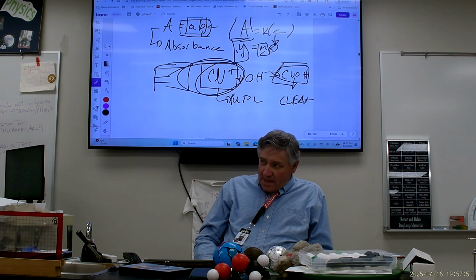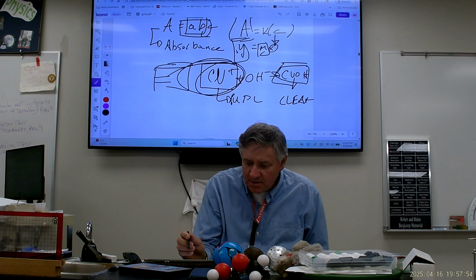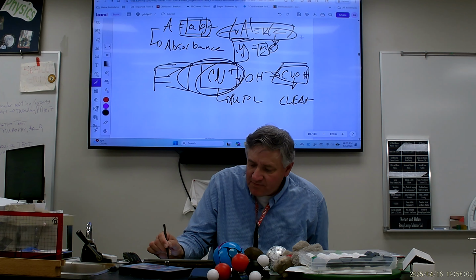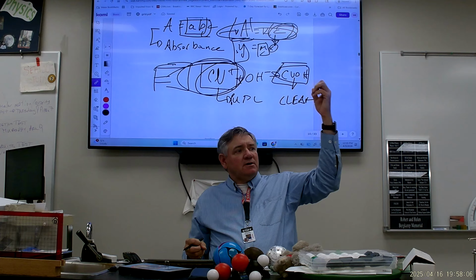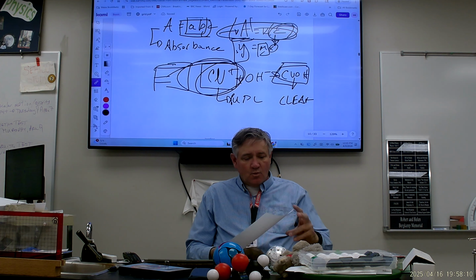Now, knowing the absorbance, you're going to go to your graph, or the mathematical function of that graph, and from that, you're going to determine the unknown concentration. Okay? That's what's going to go here.